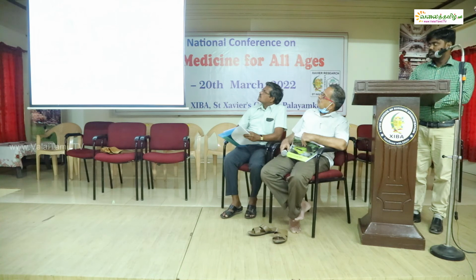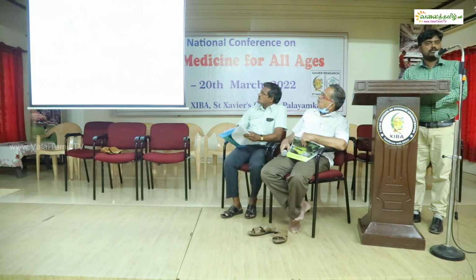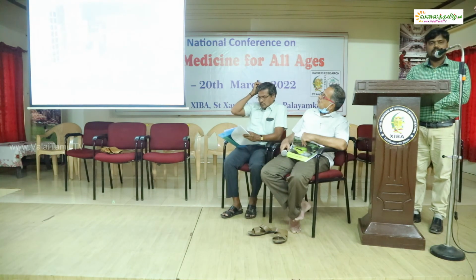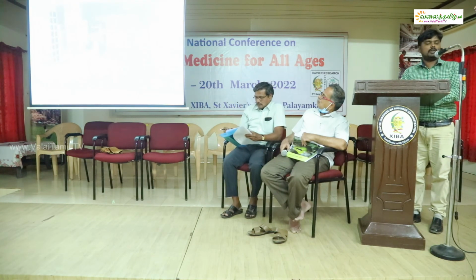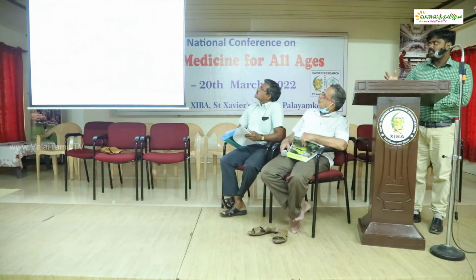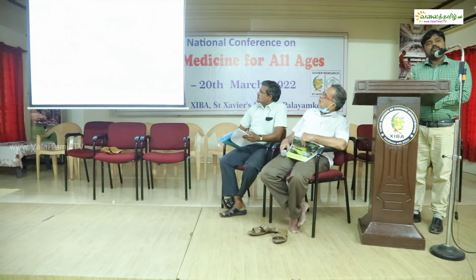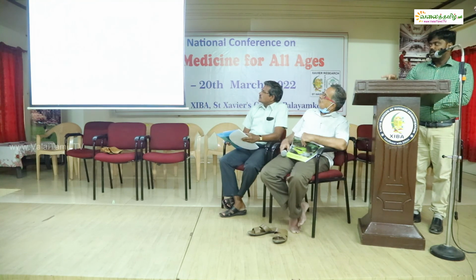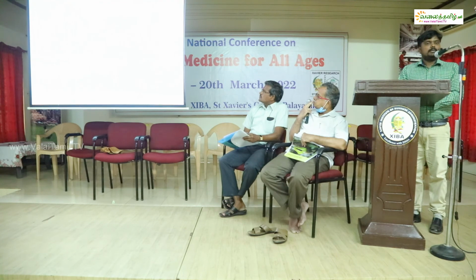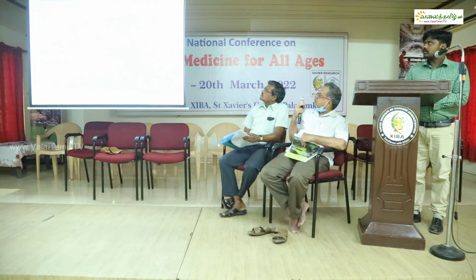Next one. So these are the instruments that we have been trying to exploit for our research process. Next slide. So this is the task that we are focusing on for our research purposes. Next slide. We have developed a method, and this method is one of the ways in which we have been able to identify the ions. So while you go for elemental analysis, I think you can go for this method to get your results more precisely. Thank you.